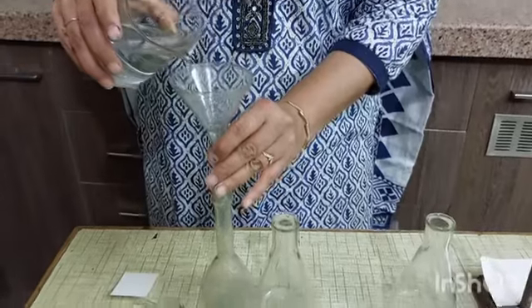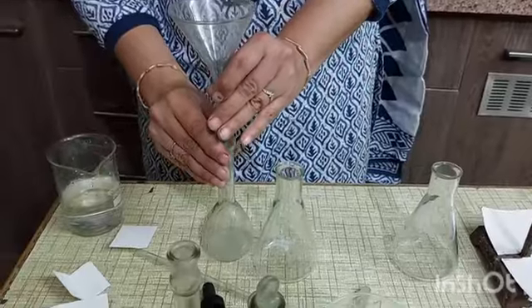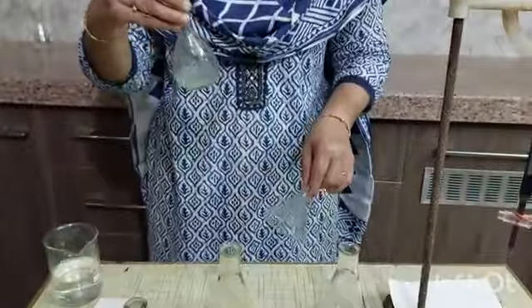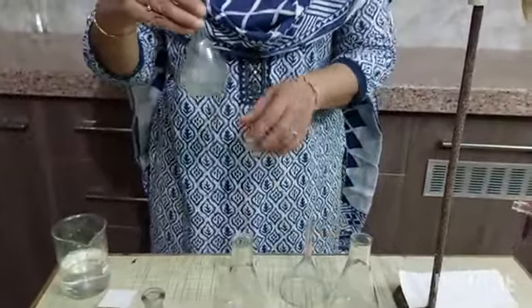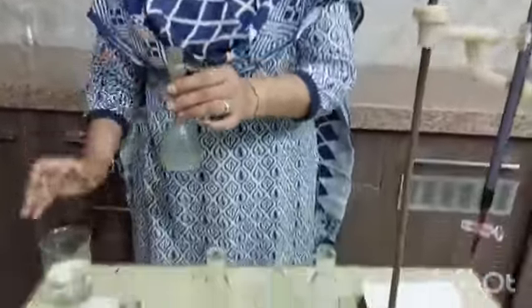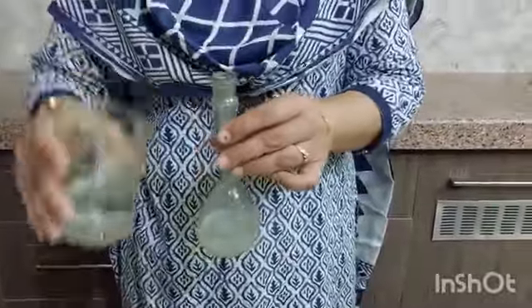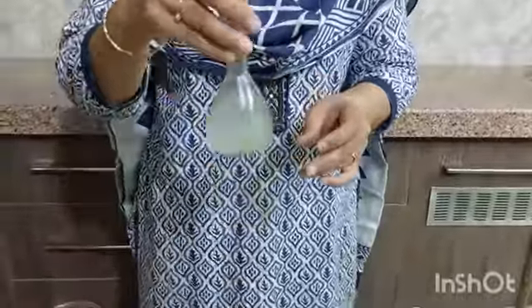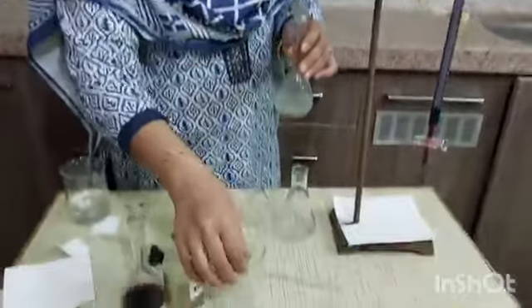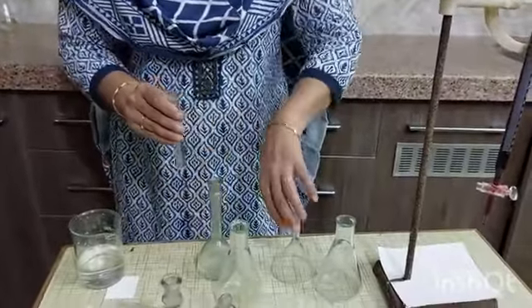Pour a little amount of water from all sides of the funnel. Dissolve this 1.30 gram of Mohr salt properly. And then add 1 test tube of dilute sulfuric acid into it.